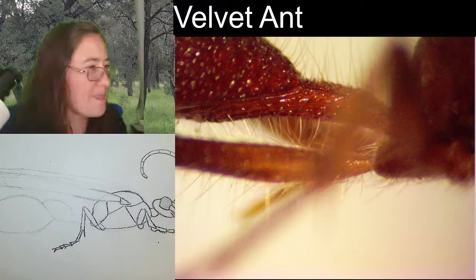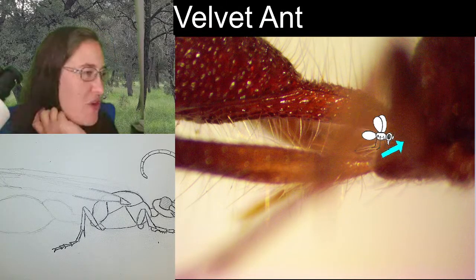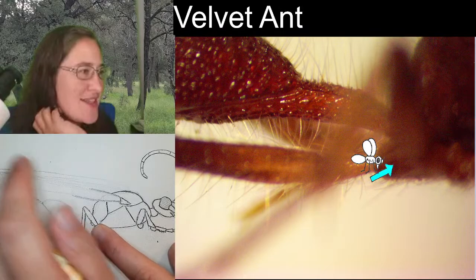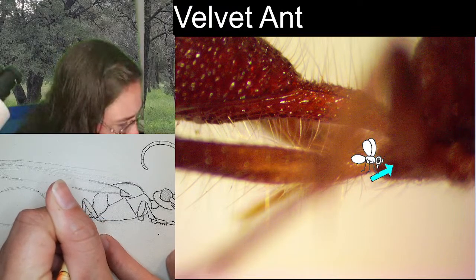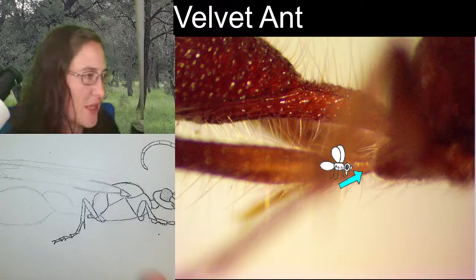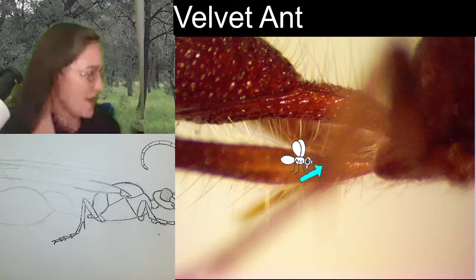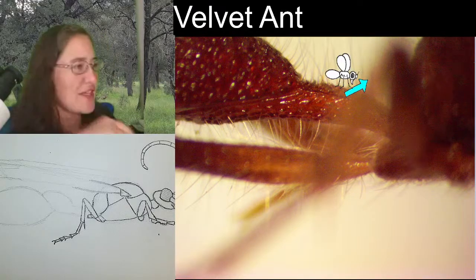Here we are. Okay, so I'm going to do my best to describe to you what I am seeing right now. This right here that almost looks like this conical piece that comes out, that's the coxal segment. And it's coming out right here from this last segment. So there's this little itty bitty piece that comes out, and it makes this little cone segment. A barrel, I guess, is more like it. A barrel segment here. And then there is another triangular piece. It goes from here to here. That's the trochanter.